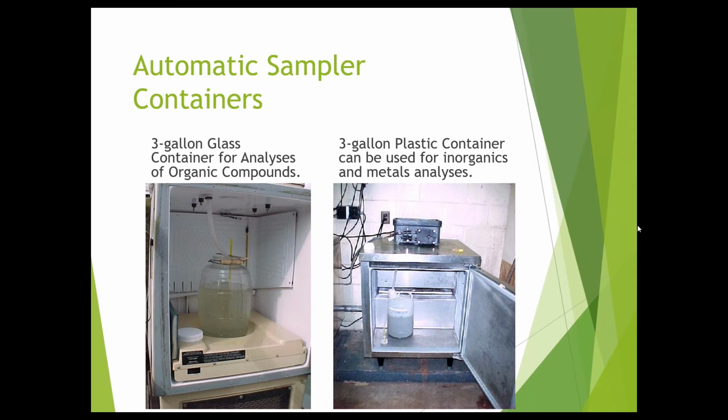But beyond 24 hours, if your sample is not below 6 degrees C, it will be flagged as not within temperature or not within the preservative temperature. It's like having it out of preservative. Buffers only last so long inside a sample. So we do want to collect our sample in our composite sampler and dispense it and get it to the lab as efficiently as possible. So let's keep going.